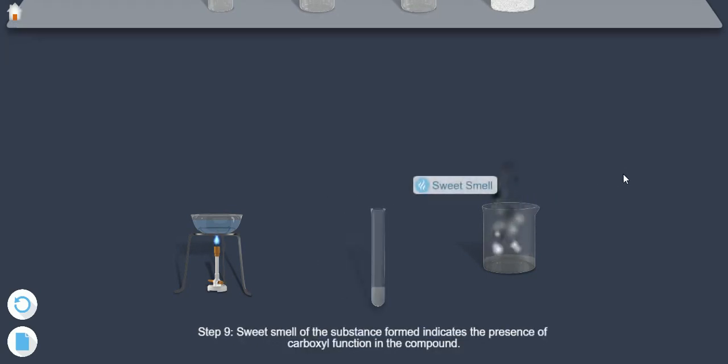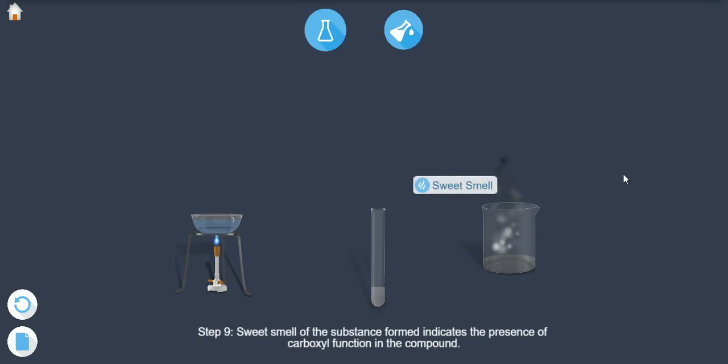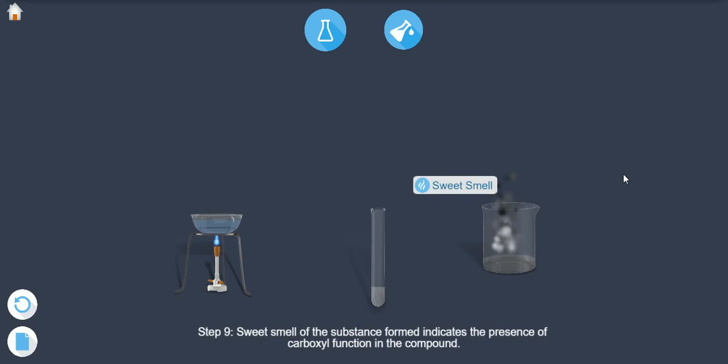Step 9: Sweet smell of the substance formed indicates the presence of the carboxyl functional group in the compound.